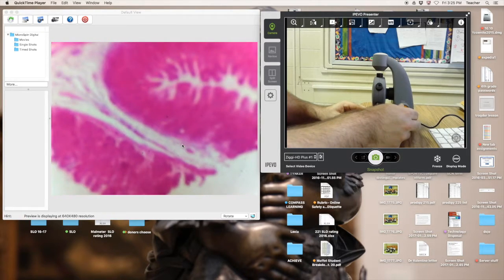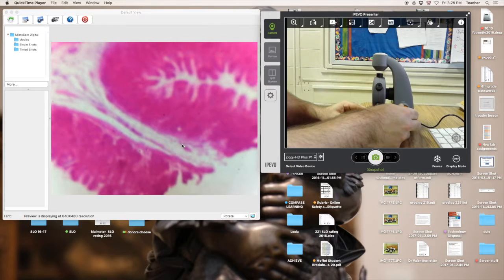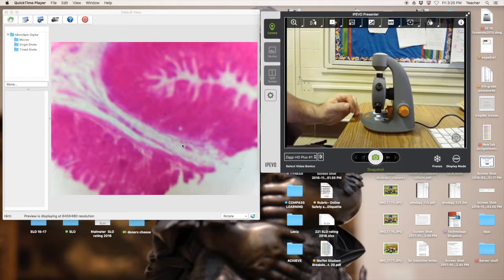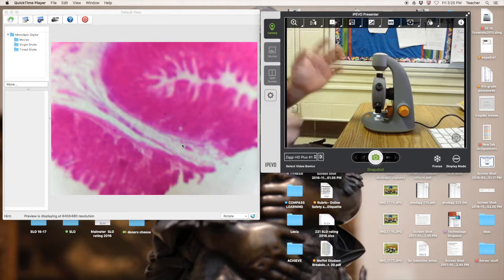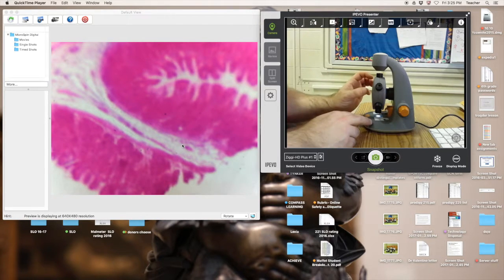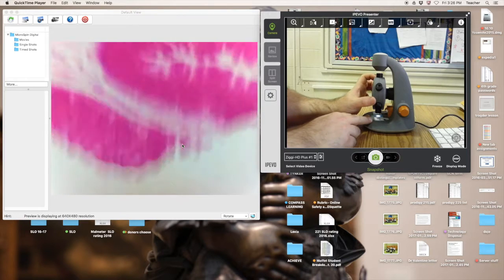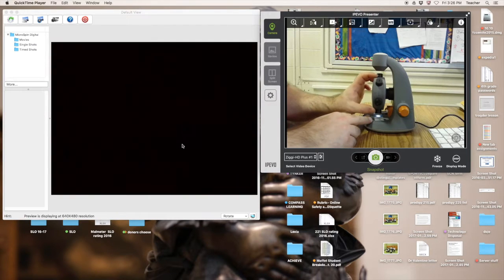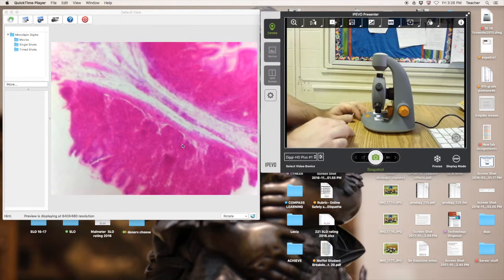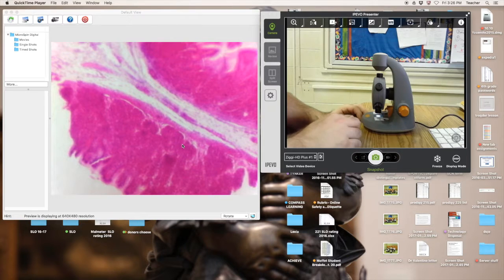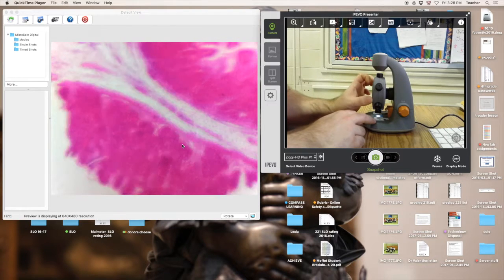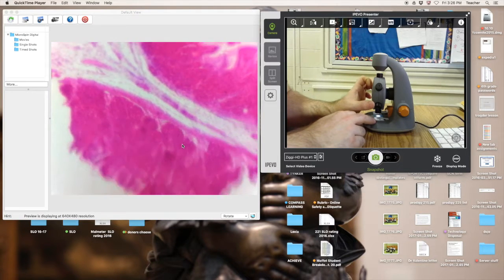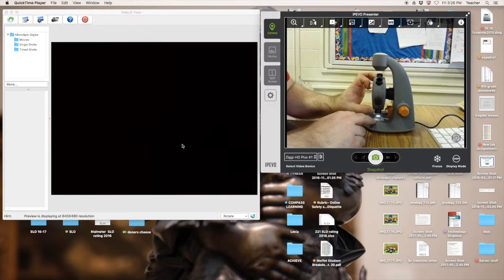It's in focus. See how much larger or how much closer we can view the slide. At this point I spin the knob. We're now on 40 times zoom. It's pretty well in focus. I can zoom again or adjust if need be.